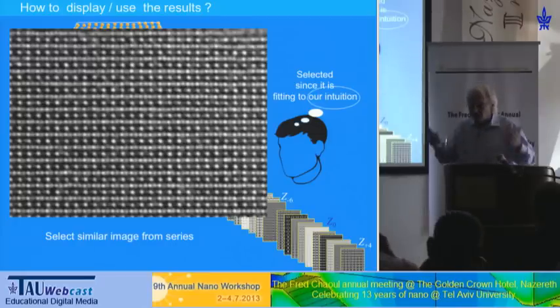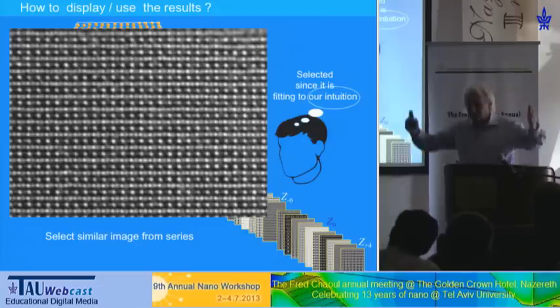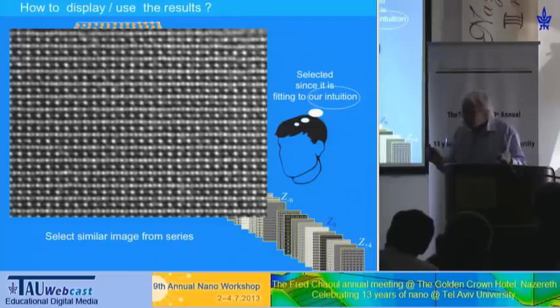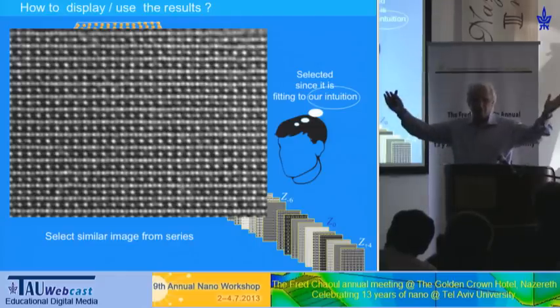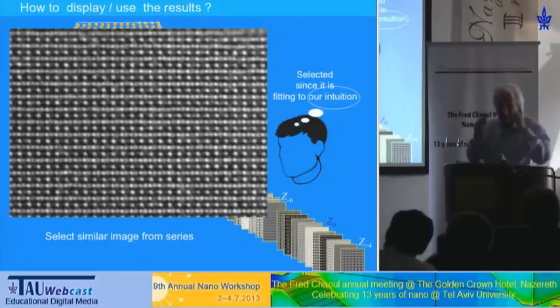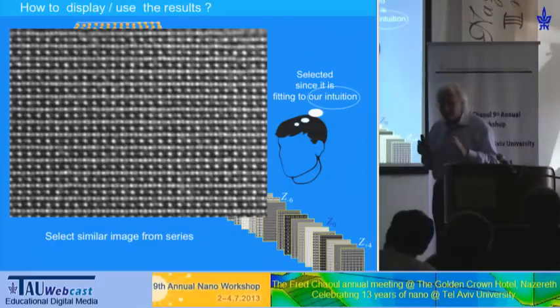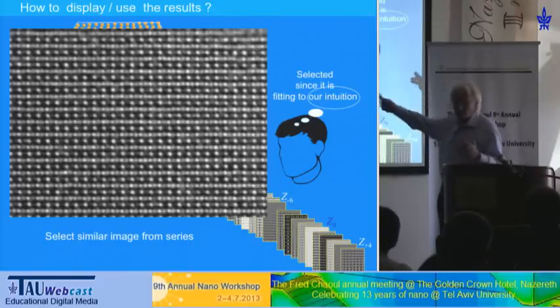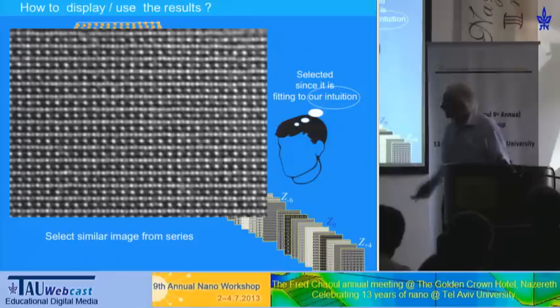And this is actually the reason why such an auditorium and even larger ones, hundreds of people, come into the lecture with the impression that we just press a button and then we have the projection of the atomic structure in quantum mechanical dimensions. So for discussing things, for publishing papers, for talking to you, it's fine. But don't take now a measurement instrument and measure the atomic positions there. This looks so wonderful as strontium titanate, so we should be happy with this.